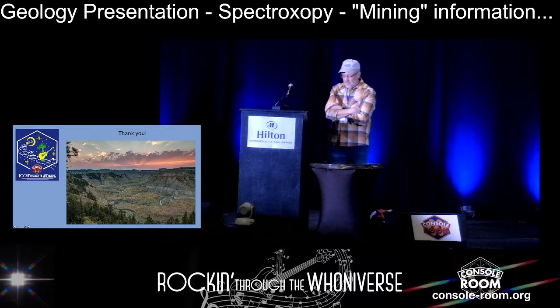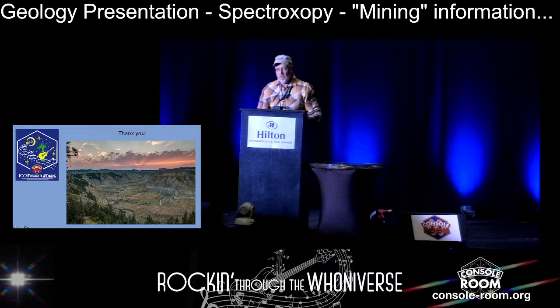Some of the machines you have must work in a vacuum, and which ones routinely go up in space for the landings on asteroids and such? Question is, do we use vacuum for these? And we do on two of those. Micro XRF has a vacuum. We don't have to turn on the vacuum for liquids, for example. The SEM uses high vacuum, and we can actually use variable pressure in that mode if we don't want to coat it, and that helps balance the charge.